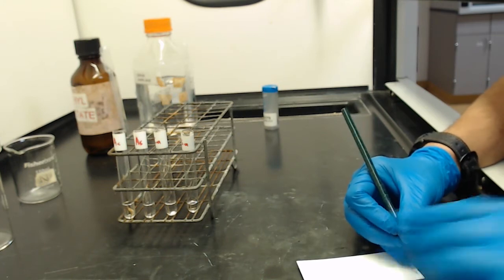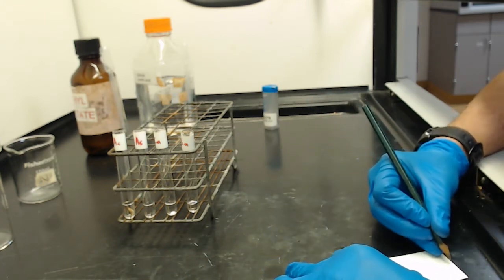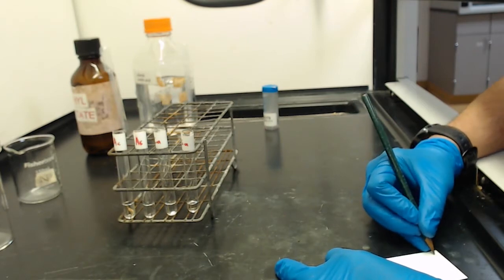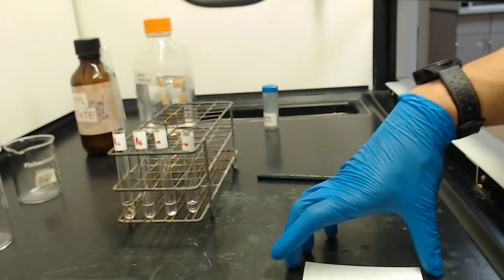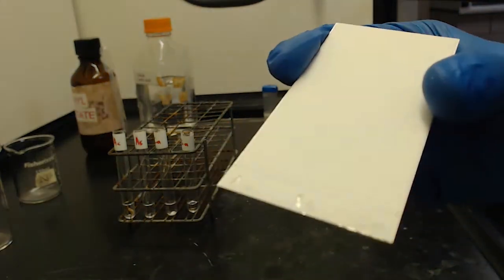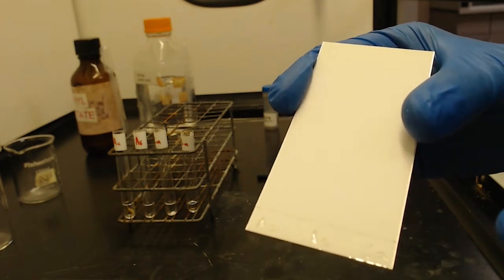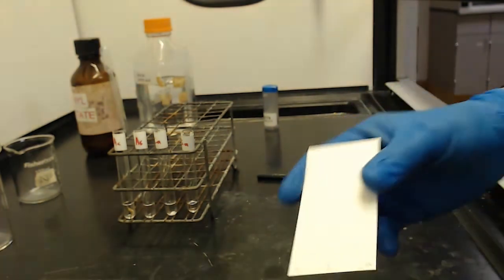So that was AC, AS, and CA. I'm not worried about this part, gouging the silica gel, because I'm actually going to be putting my samples above that point. I'm still not sure how well that's showing up in camera, but hopefully you can see it. When I spot them, I'm going to spot them on the line above where I wrote. So go ahead and do that.